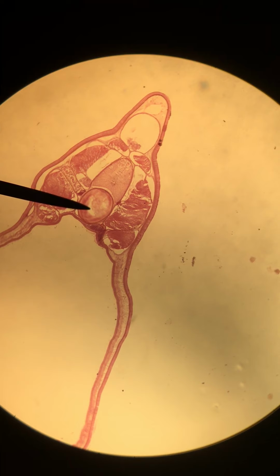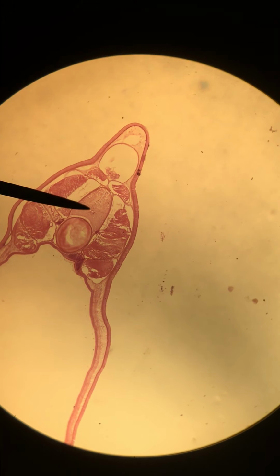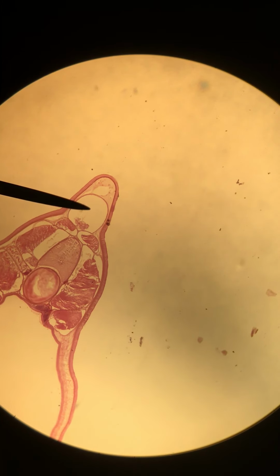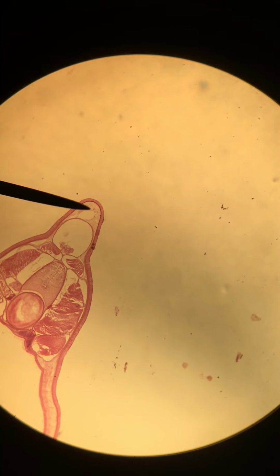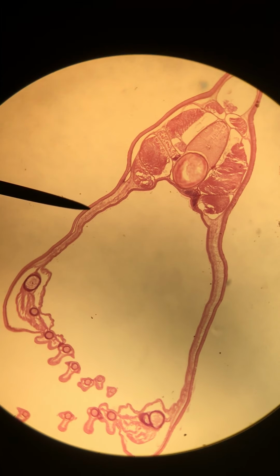And then in the center, you can see this really round structure. That's the notochord, and that is a support structure for the Amphioxus. And then just behind that, you have the dorsal nerve cord. And then just dorsal to that, you have a fin ray, which supports the dorsal fin. All right, so I think that's everything for this particular section.